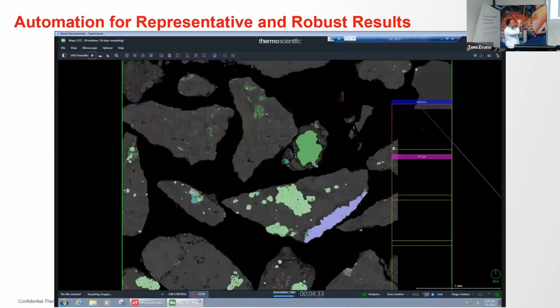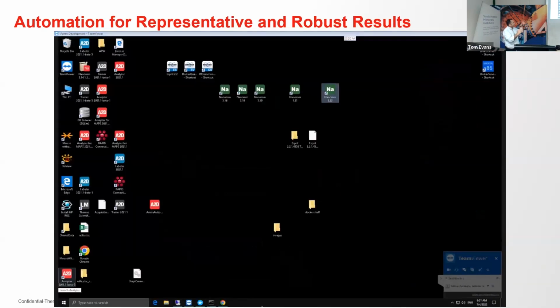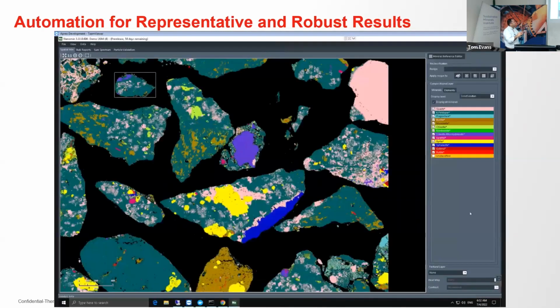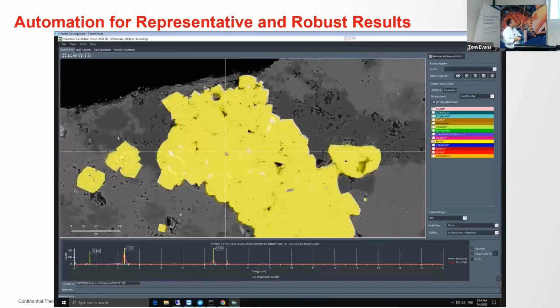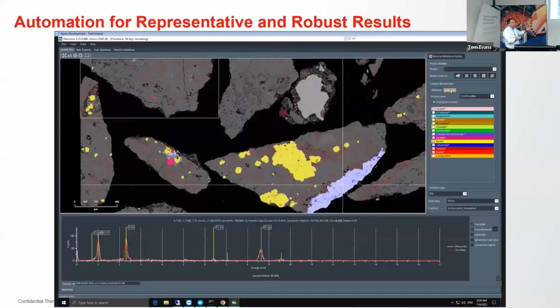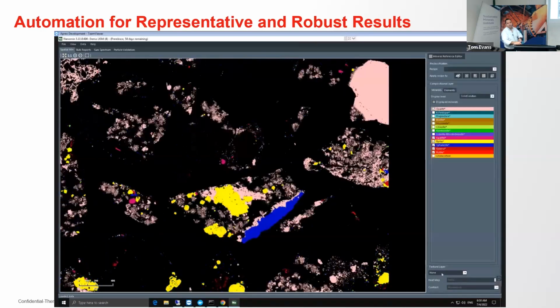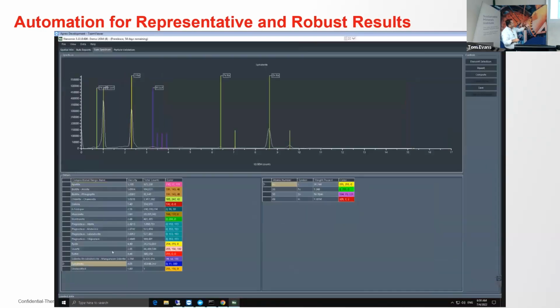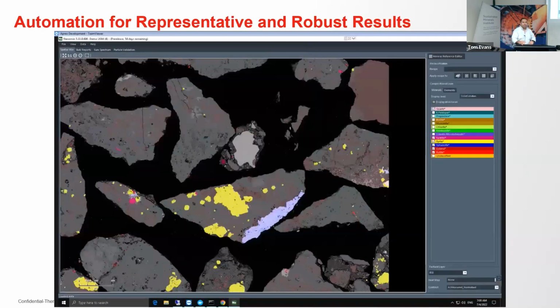If you notice, there is an overlapping region. That overlapping region is what the software will use for stitching. I showed you before and after stitching. All the fields are moved. Everything now gets classified in the support computer. Then you have all the classification, including the mixed spectrum cases like pyrite and quartz. In that case, you have element distribution maps. You can present them as heat maps. And you go into the quantification aspect using the sum spectrum. And then when you're ready, just go into the reports. So this is basically a 2-minute condensed video that I wanted to show you.